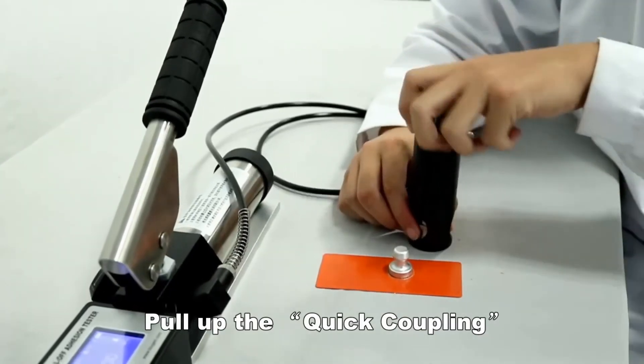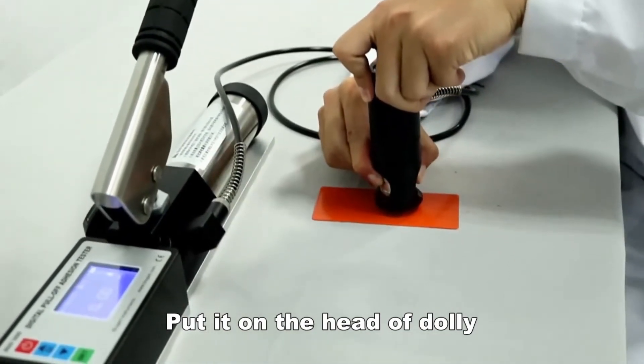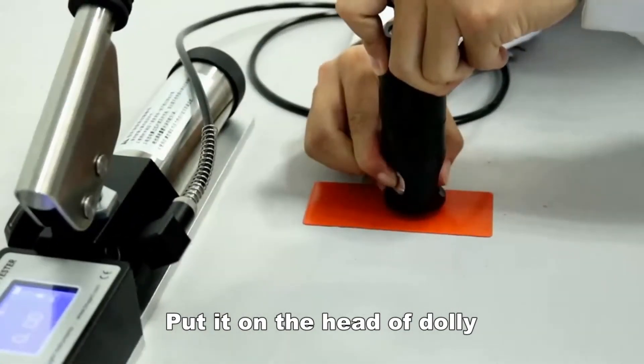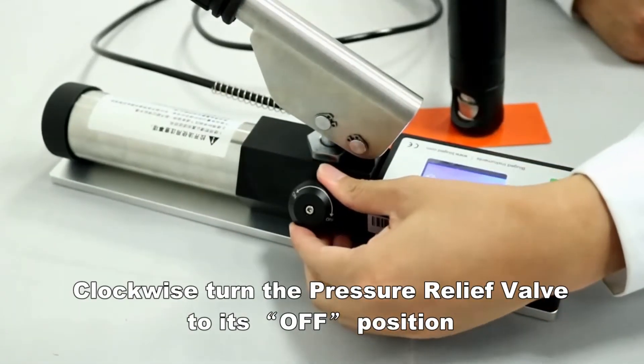Pull up the quick coupling. Put it in the head of the dolly. Clockwise turn the pressure relief valve to its off position.